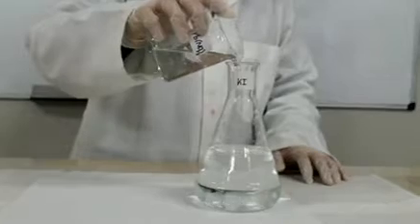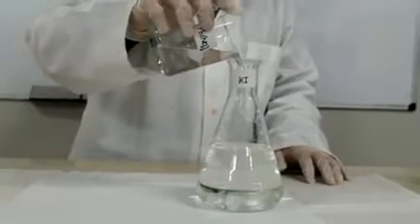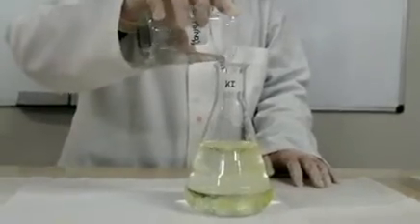First, a solution of lead nitrate is poured into a solution of potassium iodide. On mixing the two solutions, a yellow precipitate forms.